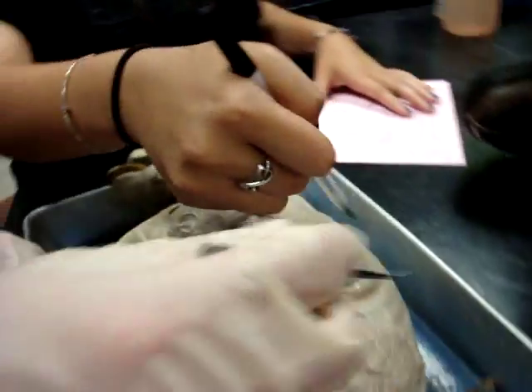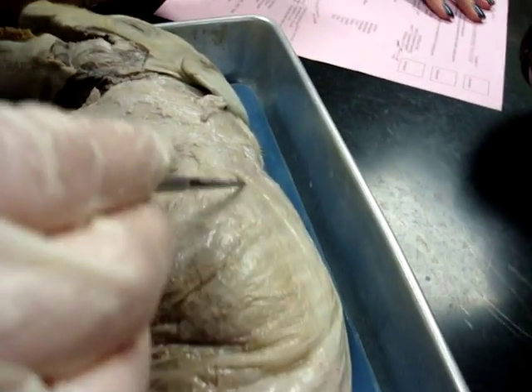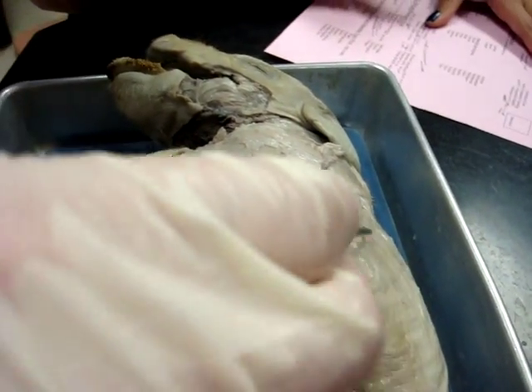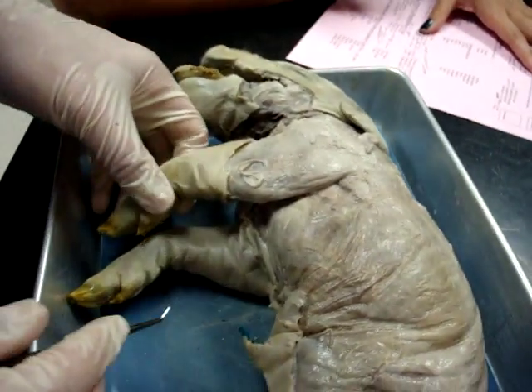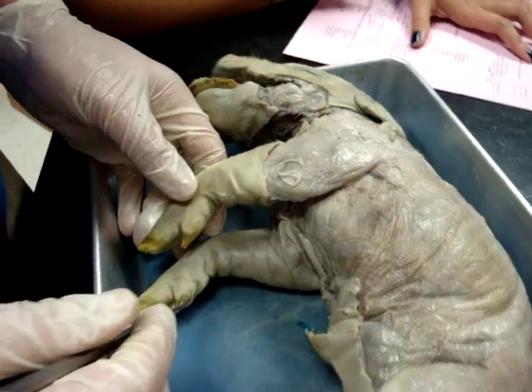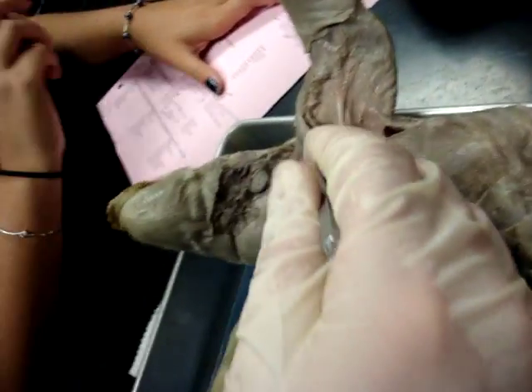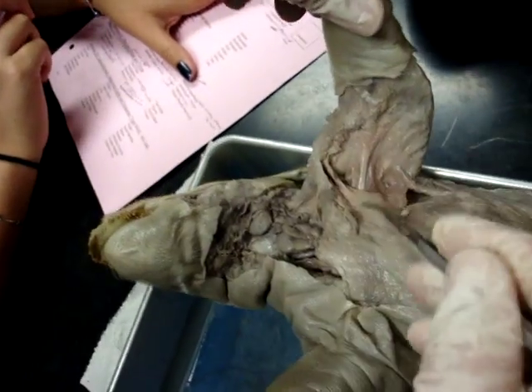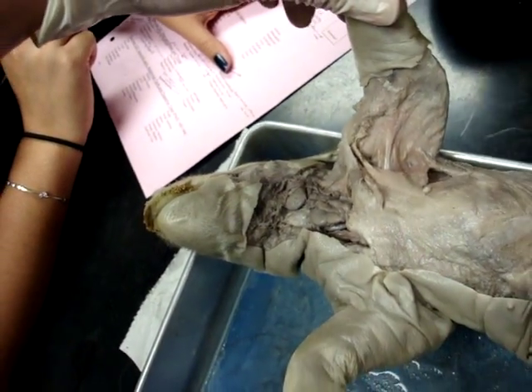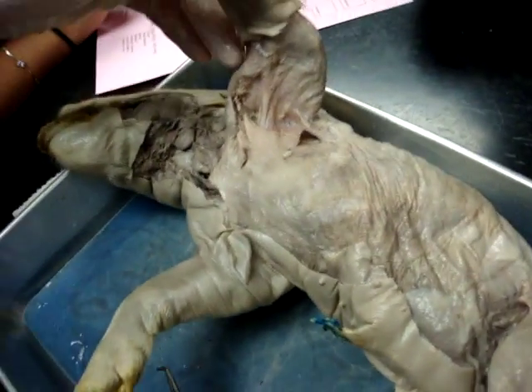Latissimus dorsi — look for the direction of the fibers going this way. The fibers go that way. Very good, that's your latissimus dorsi. Where is your pectoral muscle? Superficial one — do you have a superficial one? It connects to the arm, it would be on the top right here. You kind of cut through most of it. Well, actually Hugh did. Never let Hugh touch this stuff.